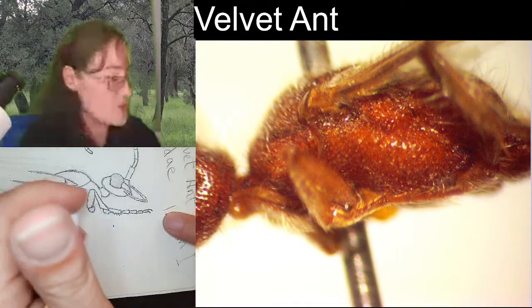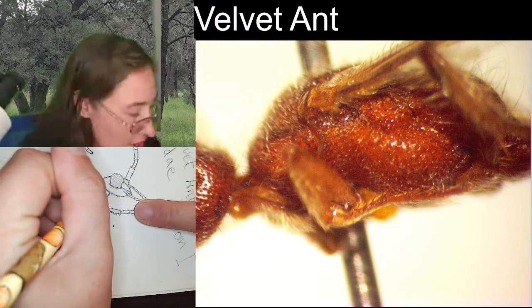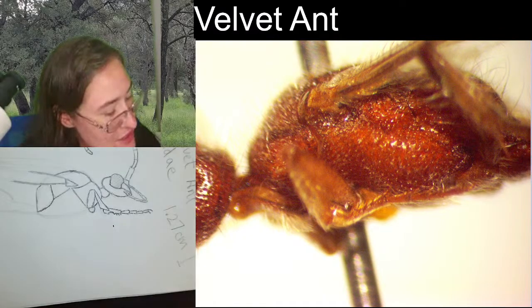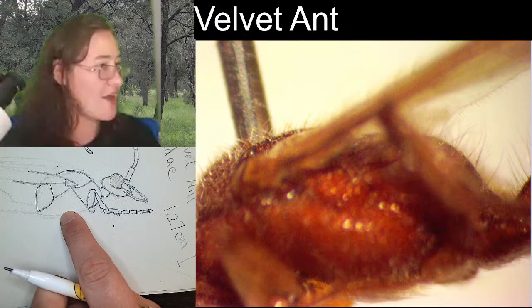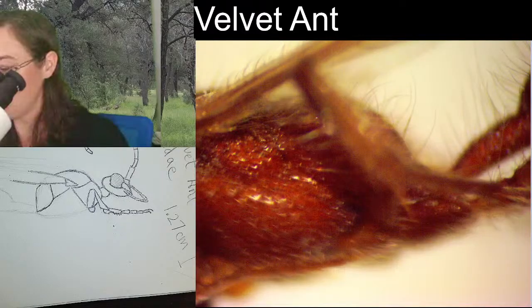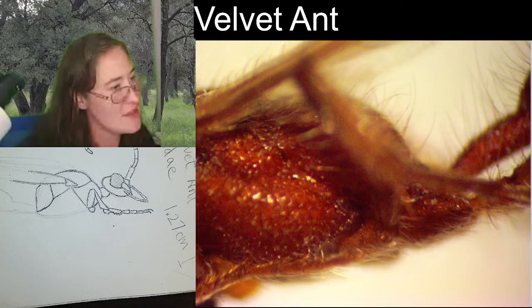So now that I've got most of this leg situated, I can darken the mesosoma around it. We do have this large plate here that is the second segment of the thorax that comes all the way down to this point here. And you can actually see the coxal segment right here.